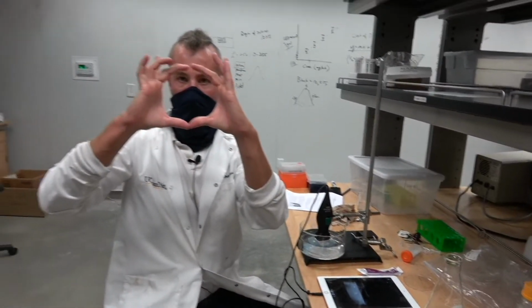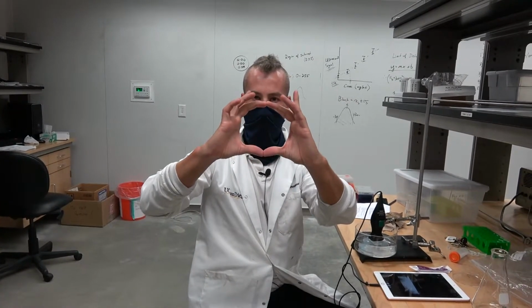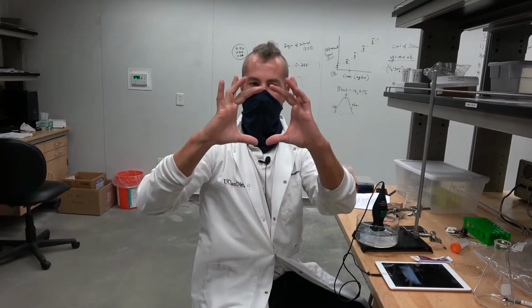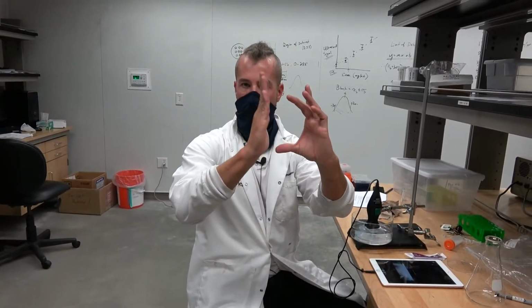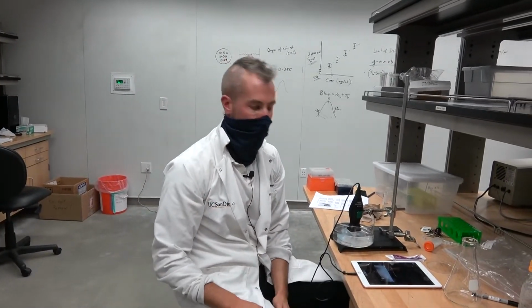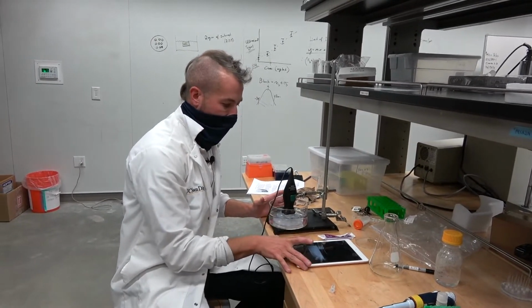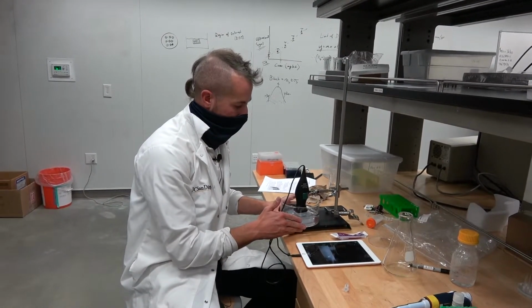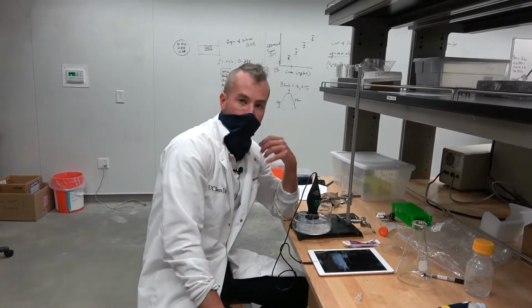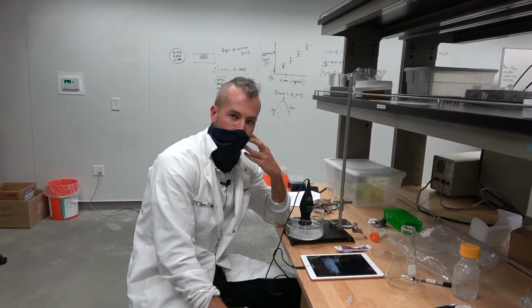So if you think about imaging one of these holes, how do you do your replicate samples? Well, you could do one like this, and one like this, or you could do 1, 2, 3. It doesn't really matter, but what you do want to get is multiple images. So we're not going to walk you through each and every one of these image collection points, but what you are going to get is 3 images per sample that you can then use for image processing.